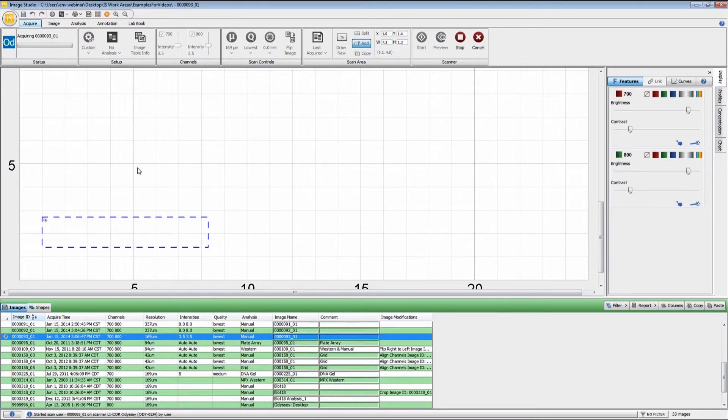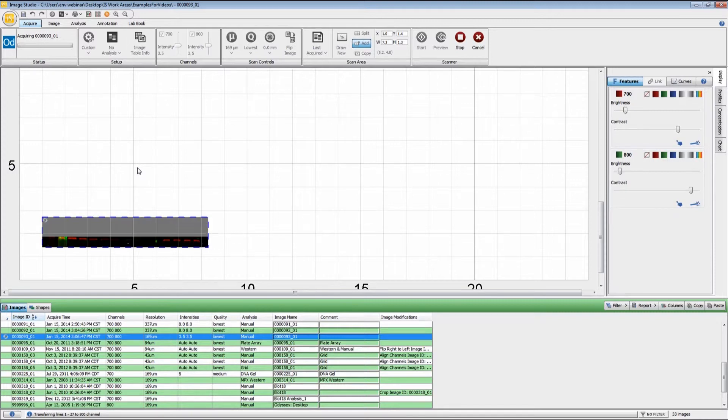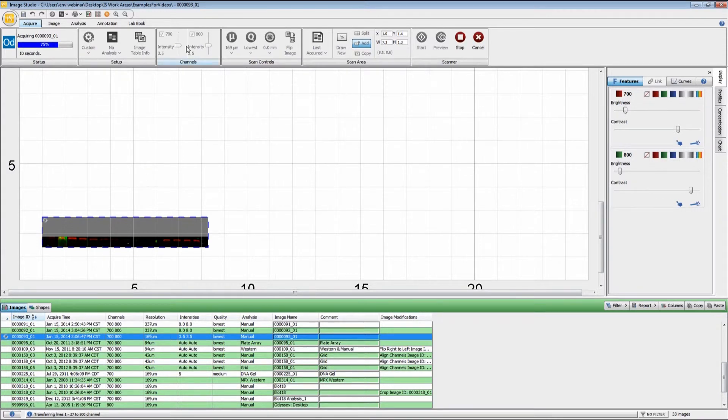The scan has started now, and momentarily we will have the first part of the image appear. You can see that changing the intensity values has a dramatic effect on the appearance of the image.